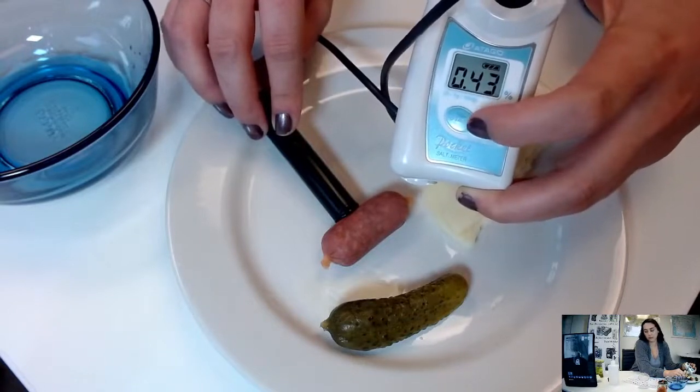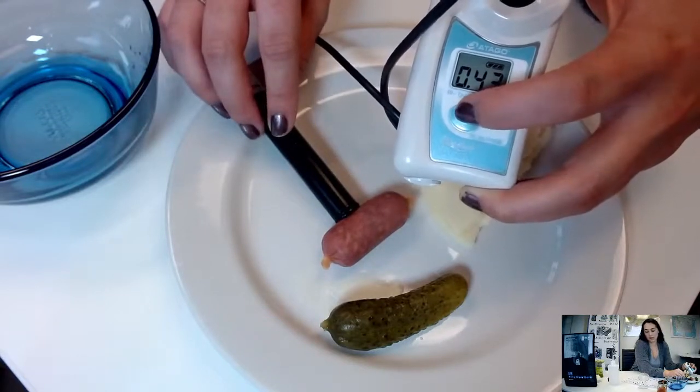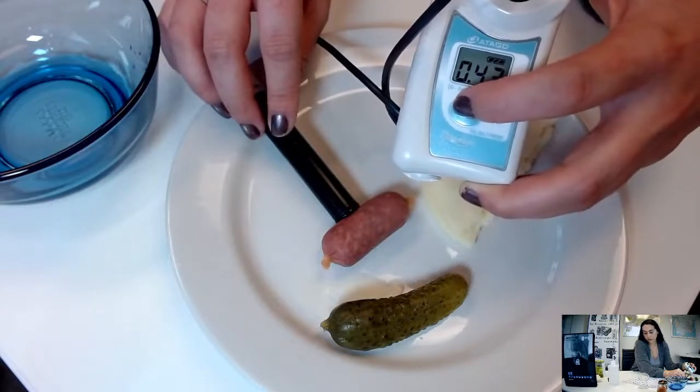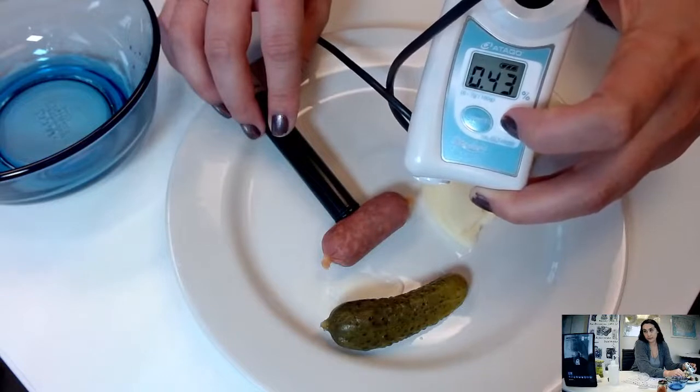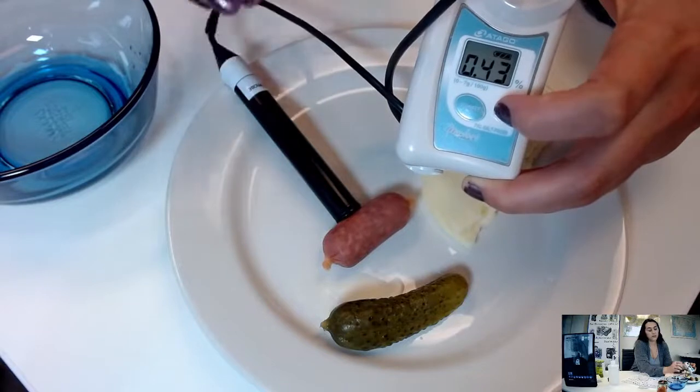And like I mentioned, the sausage was a little cold, so we're going to wait a couple seconds, then we'll press it again and see if we can get the same reading. Right. 0.43, perfect.